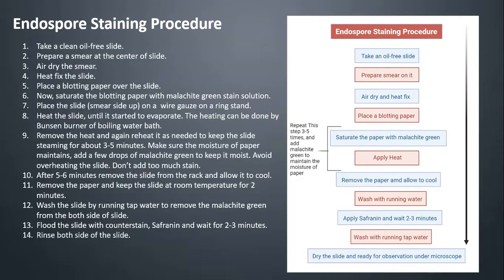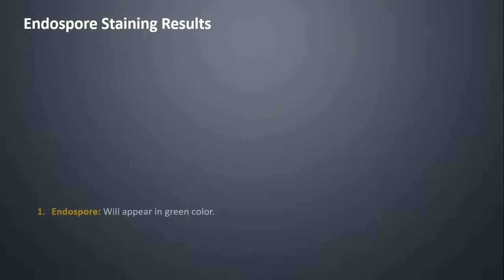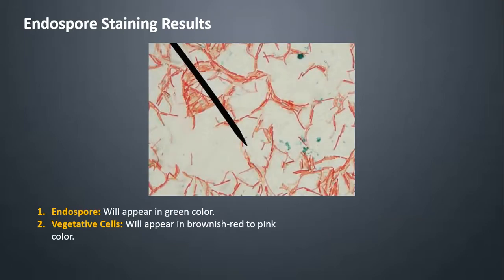Step 14, rinse both sides of the slide. Step 15, allow the slide to dry for a few minutes. Step 16, the slide is now ready to observe under the microscope. Endospore staining results: endospores will appear in green color, and vegetative cells will appear in brownish red to pink color.